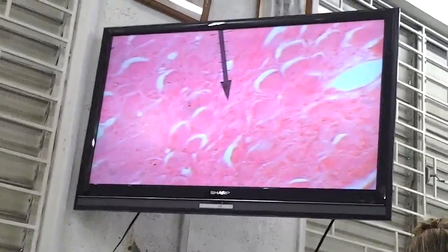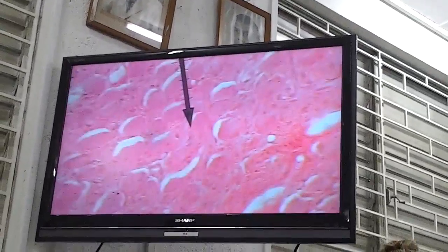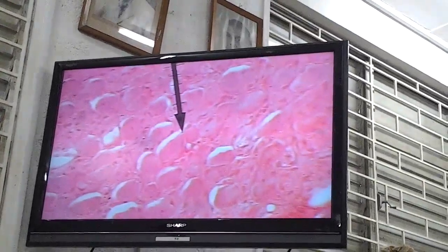Okay? So we're going to spend an hour. I don't think we'll be here for any more than an hour. First half an hour looking at neuro or maybe less. So what are we looking at here now? So Jessica, what are we looking at now?